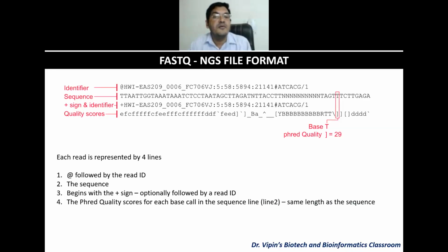Yes, Gaurav, you raised a hand. Sir, I have a question. Usually Galaxy also gives the FASTQ Sanger format. What is that actually? It's basically similar to FASTQ, not too much of a difference. If there is some, I'll cross-check and get back to you tomorrow. I'm not sure what exactly the difference is, but I've seen FASTQ Sanger mentioned in Galaxy, right? Okay, I will get back tomorrow. Thank you, sir.